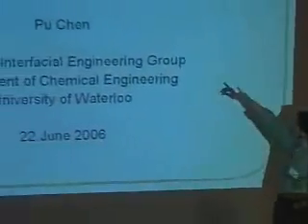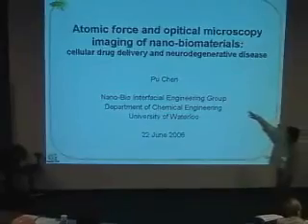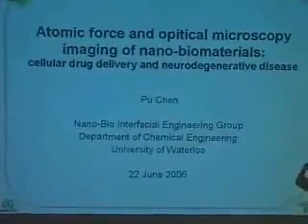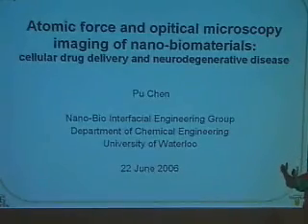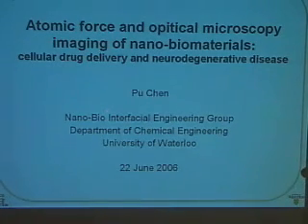The title here is Atomic Force and Optical Microscopy Imaging of Nano-Biomaterials. Atomic force microscopy is really a driving force for the current wave of nanotechnology, because since 1986, when we got the AFM, people have been able to see things which they haven't been able to see in the last few decades. I will discuss more about it.